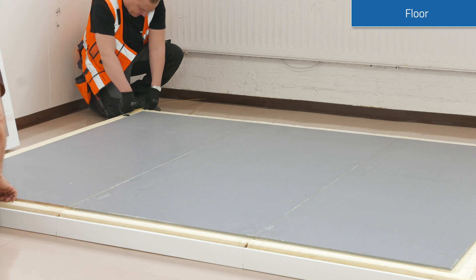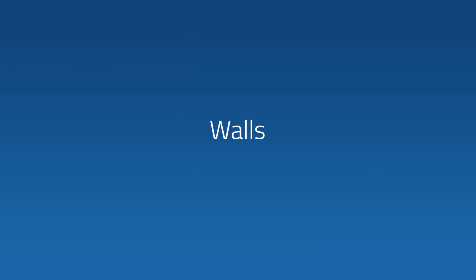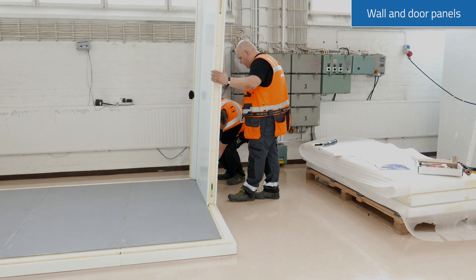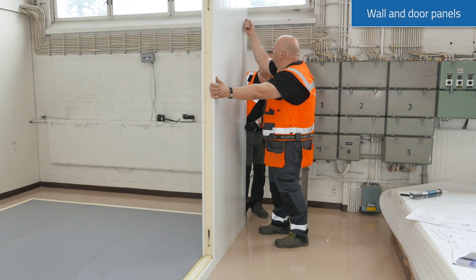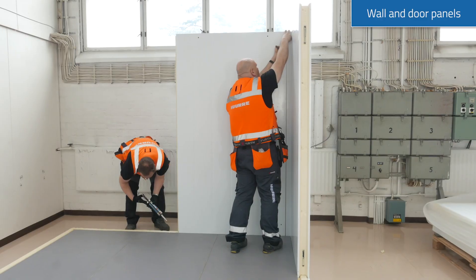Leave a gap of 50mm minimum between a freezer room and the surfaces of the surrounding building. With the wall panels, it is best to start from the corner panel and attach firmly the first basic wall panel. Be careful and remember to lock them tightly to each other.